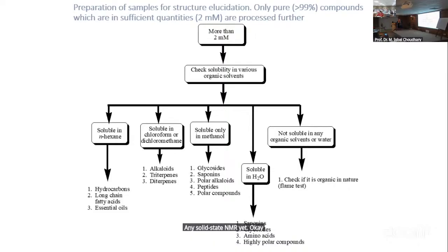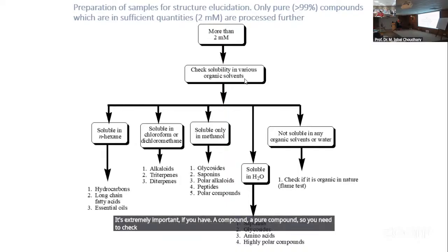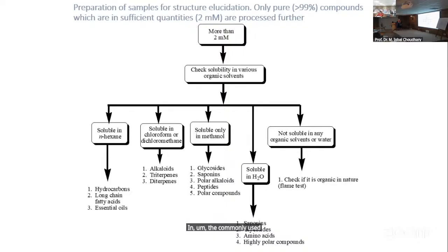That's why solubility is extremely important. If you have a pure compound, you need to check if it is soluble in the commonly used deuterated solvent.